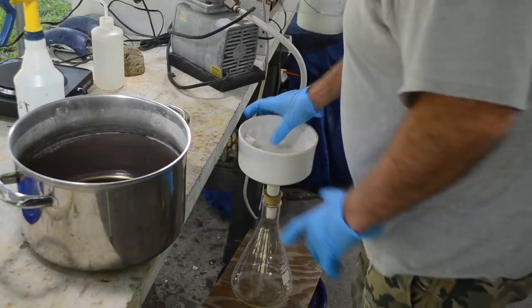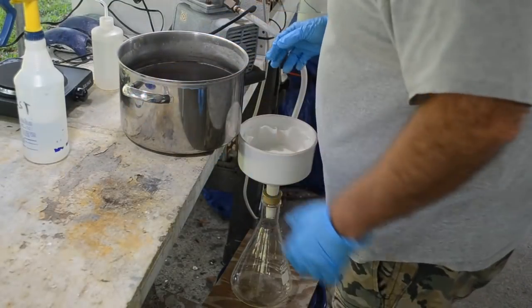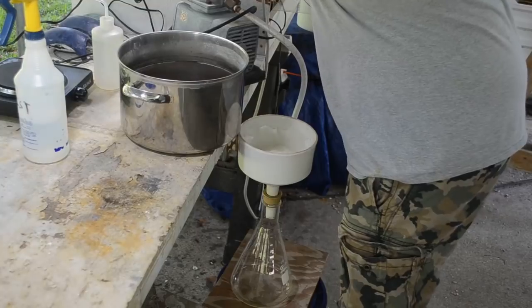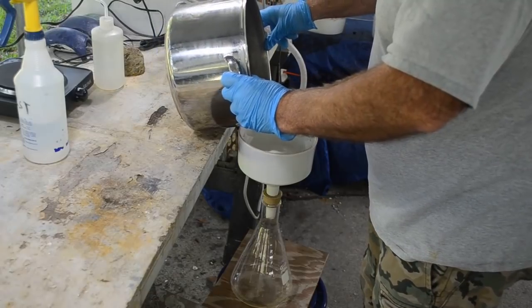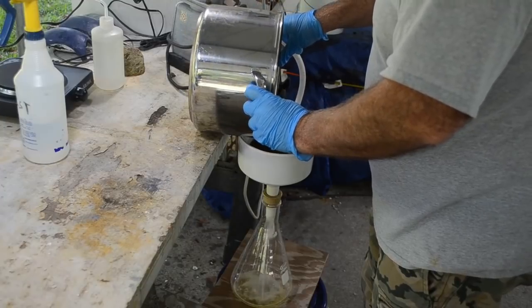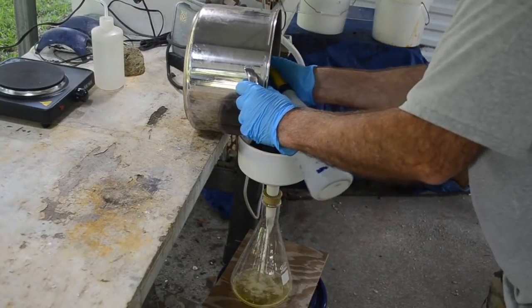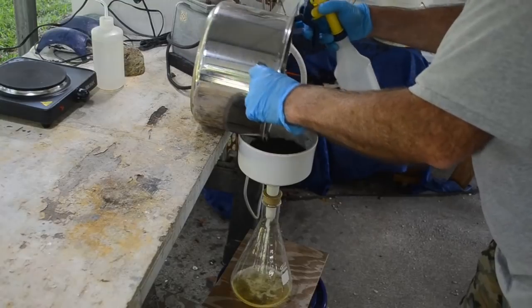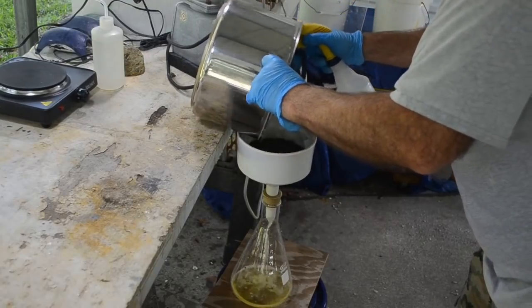All right. Got the filtration set up ready to go. I've got enough of the liquid out of this that I can handle it easily and carefully pour the rest in. And it looks like it had the same problem as before, which I expected. Got a lot of stuff stuck to the bottom of the pan. Yeah, the spray bottle gets some of it loose, but I'm going to have to scrub it again, at least a little bit, to get the rest of it out.